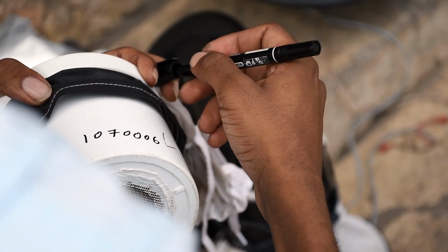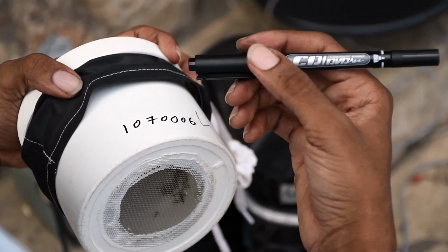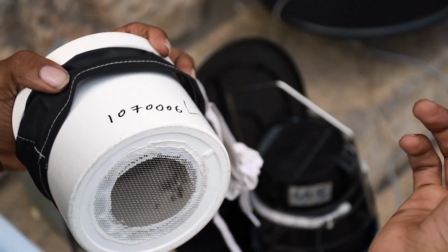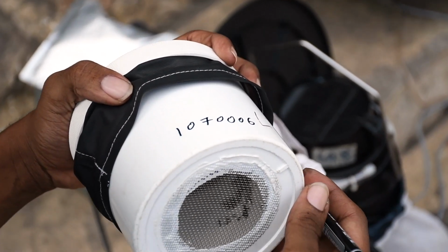This specific code allows us to retrace the mosquito back to this particular house and this particular location. We can also use this code to assign it to the Eppendorf tube once we're in the lab, which can later be used to trace the mosquito back to its roots.